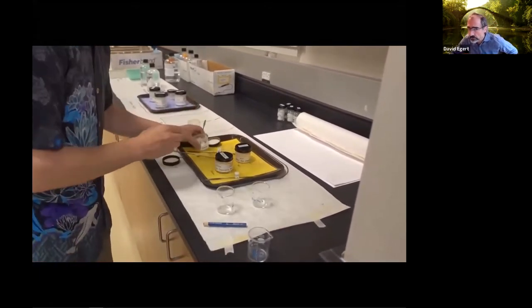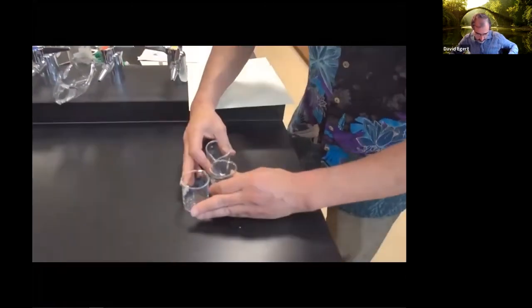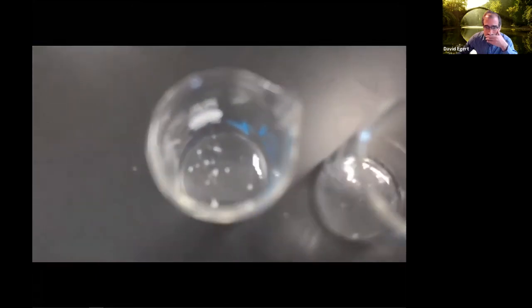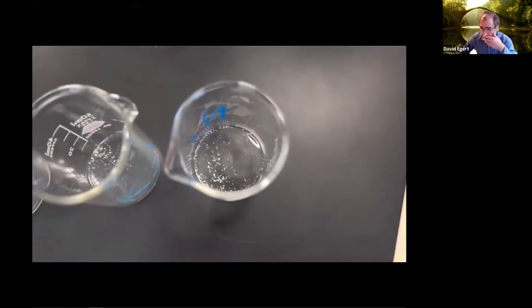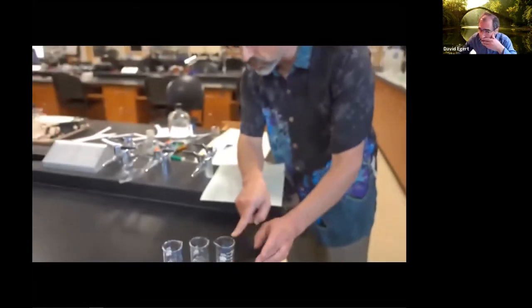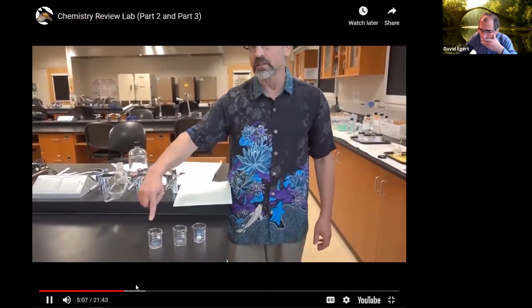All right. So I'm going to take these and put them with a black background where I think it's going to be easier to see. In each case, hopefully you'll be able to see these little white crystals at the base of each of them. Right here we have the sodium chloride, which is just ordinary table salt. This one is potassium chloride. This one is the calcium chloride.